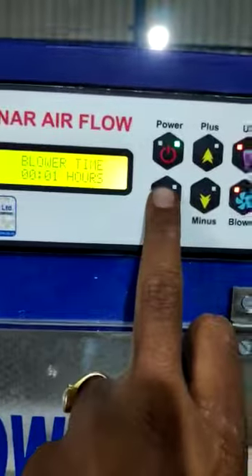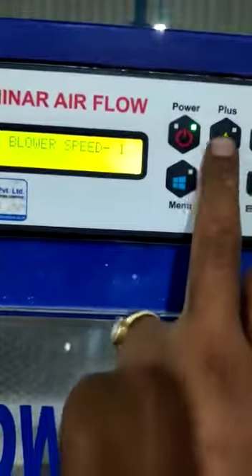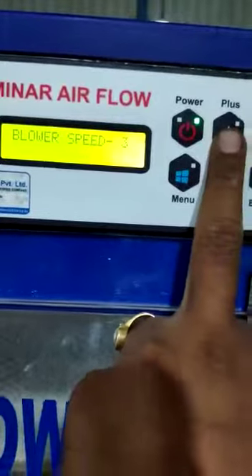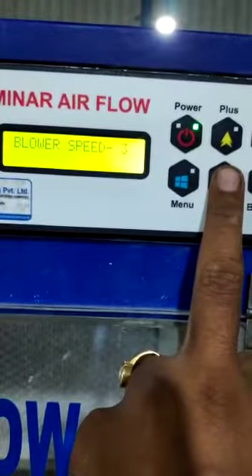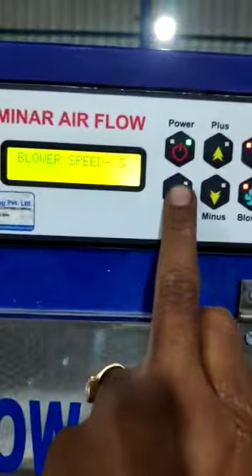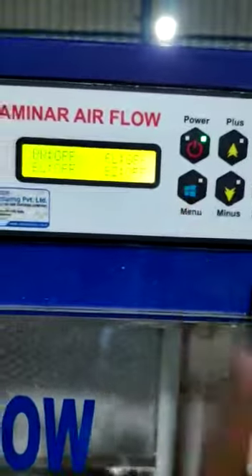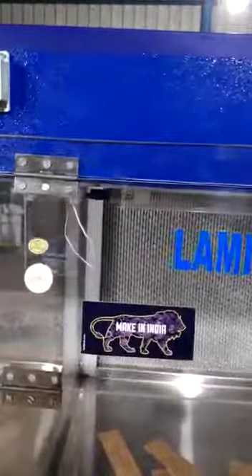Up to 1 minute. Now blower speed: 1, 2, 3 — we have a 3-speed motor from GE, and it works in 3-speed manner: first low, medium, high. Press this — your program is successfully done. RA ISO 9001-2015 GMPC, Make in India company.